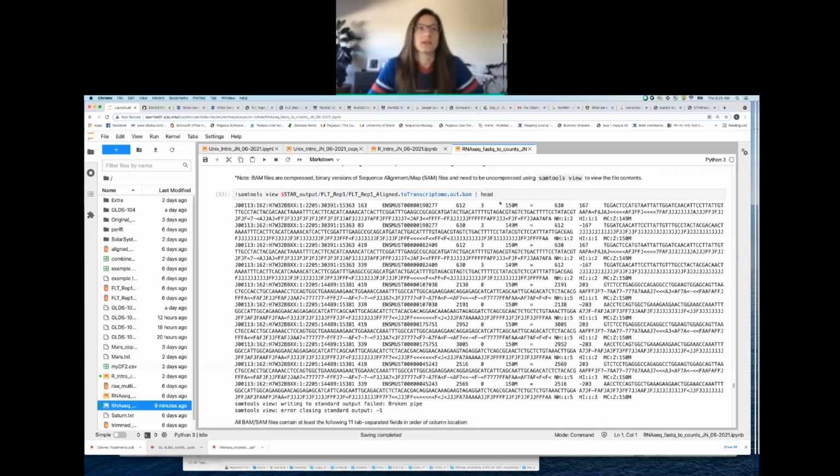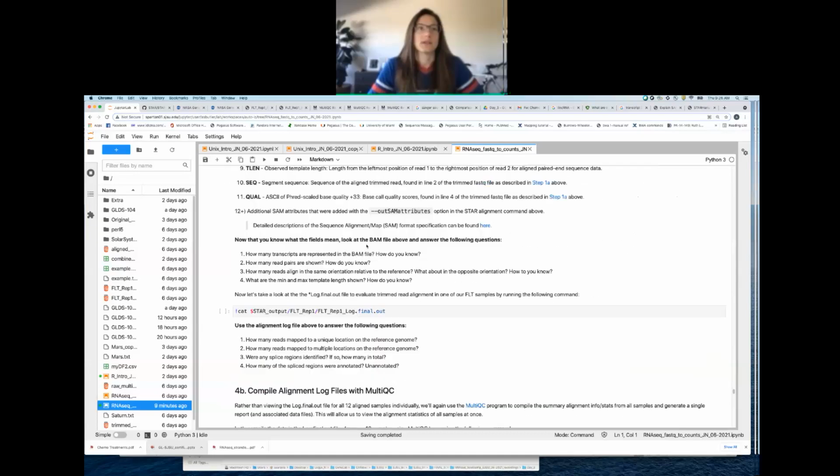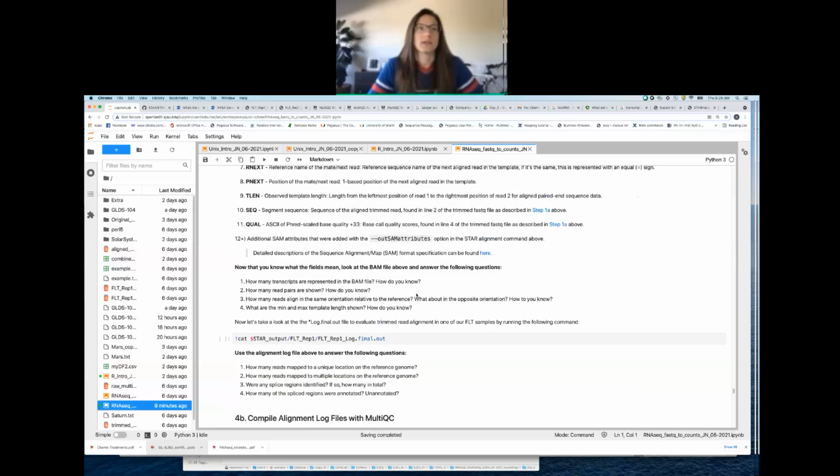I just piped it into head because this is aligning all of our reads, and there are over 60 million reads, as we saw earlier in this sample, so we really just want to look at the first few. Then you have the questions at the bottom that we went over, taking a look at that BAM file.